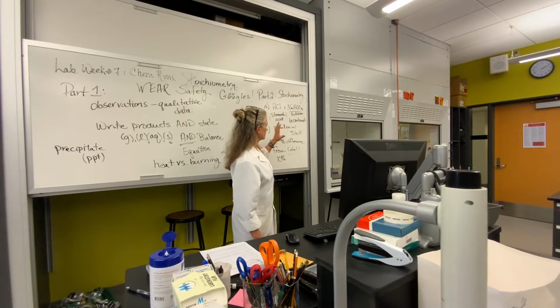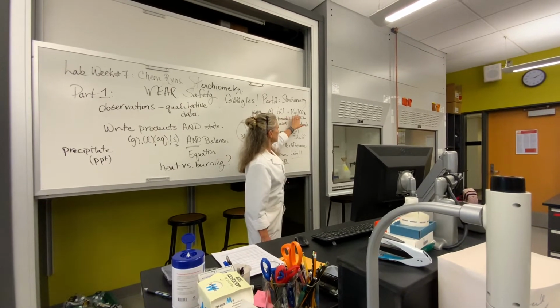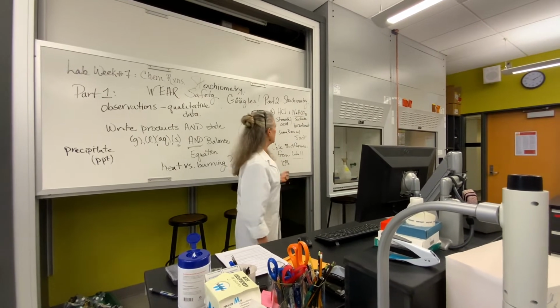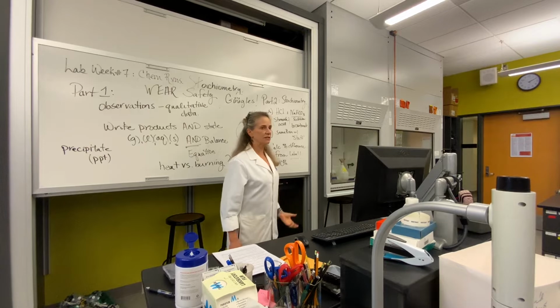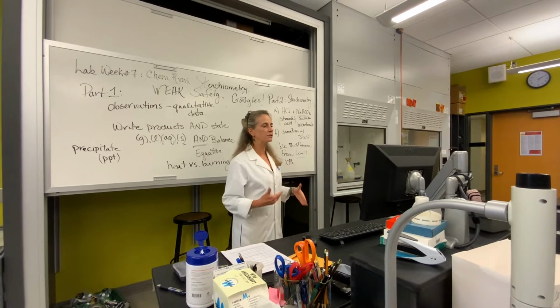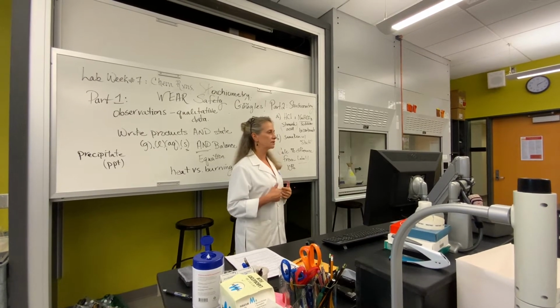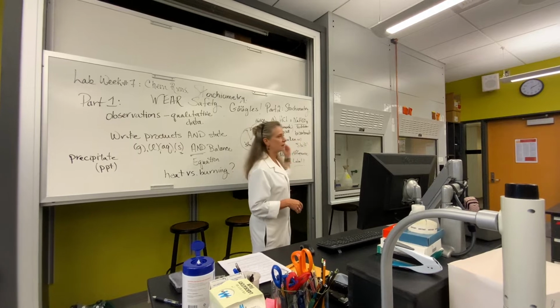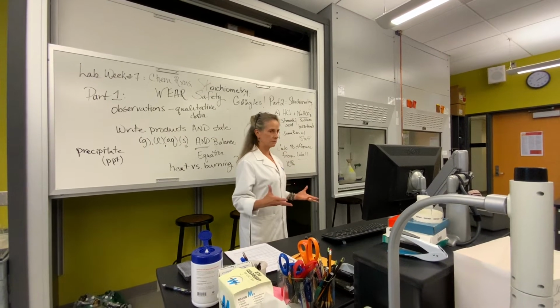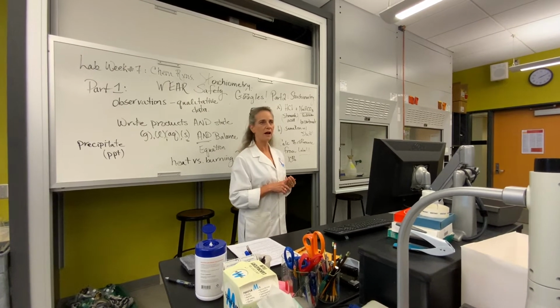In both parts, the reaction, and I'll show it to you on the lab, you're going to do hydrochloric acid reacting with sodium bicarbonate, which is just baking soda. This is representative of the acid in your stomach, because we're using Alka-Seltzer tablets ultimately. When you have acid belly, you take Alka-Seltzer to settle it down, and it's neutralizing it, okay? If you look at the reaction, you're going to make salt water and carbon dioxide, and that's probably why you burp a lot when you take Alka-Seltzer, if you have.